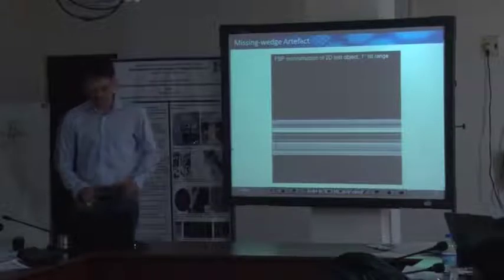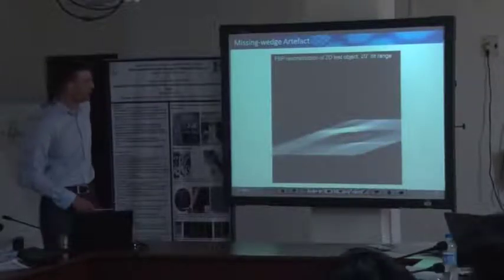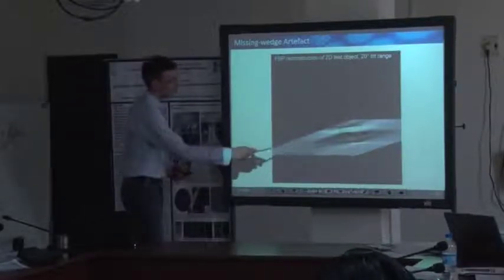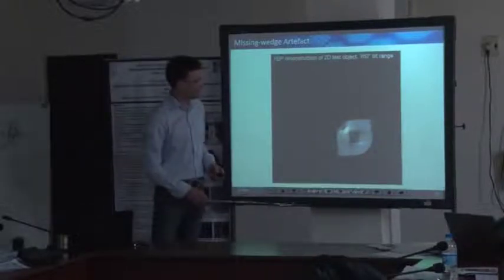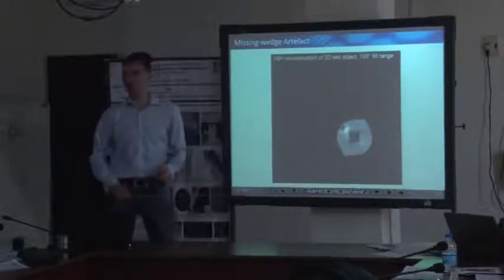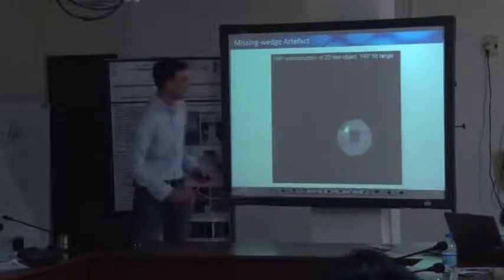we will see. If we use a second projection, or some more, this is 20 degrees already, we can already imagine that there is our object. And if we add many more projections, we get closer and this reconstruction resembles our object.